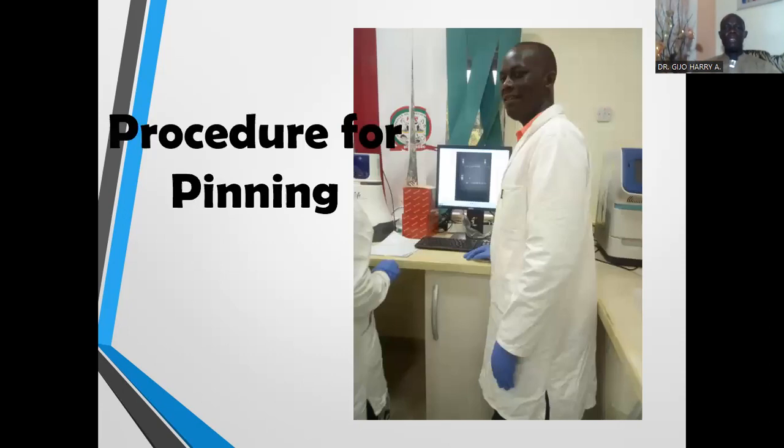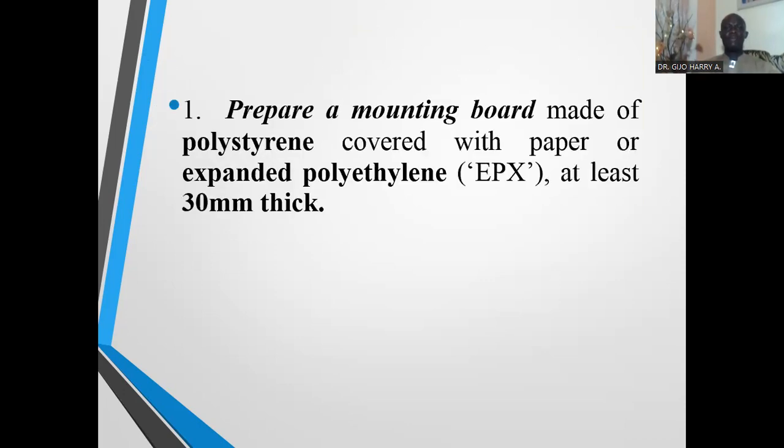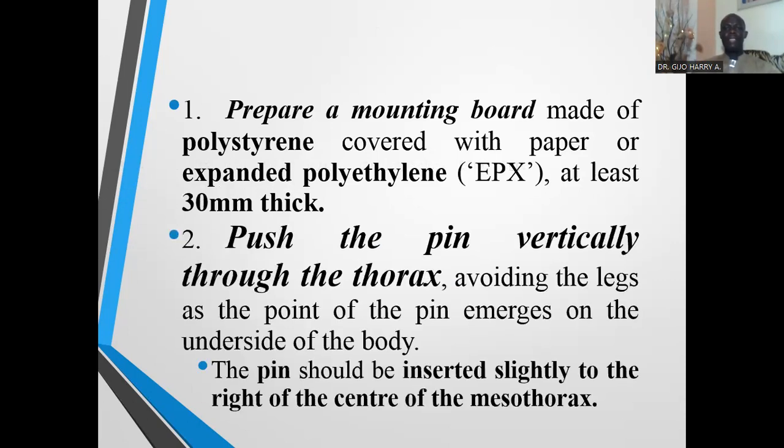Now, the procedure for pinning. We want to look at the procedure for pinning insects and arachnids. The first step is that you prepare a mounting board made of polystyrene covered with paper or expanded polyethylene, at least 30 millimeters thick. The second step is that you push the pin vertically through the thorax of the insect, avoiding legs, as the point of the pin emerges on the underside of the body.